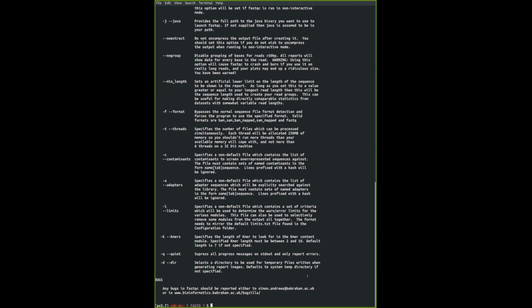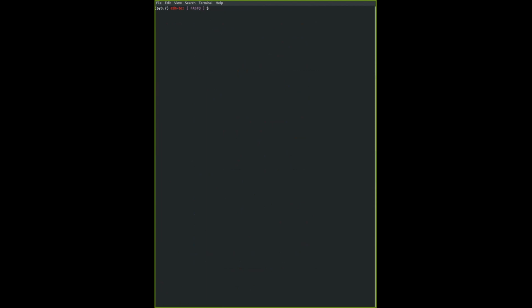So we're going to create this script in our script directory. If you created the directory as we did last 2 weeks, the script directory is in, let me clear the screen first so you can see. So clear the screen, so cd, it's in home, followed by RNAseq, workshop, tab, and scripts. So this should be where the directory for scripts is.